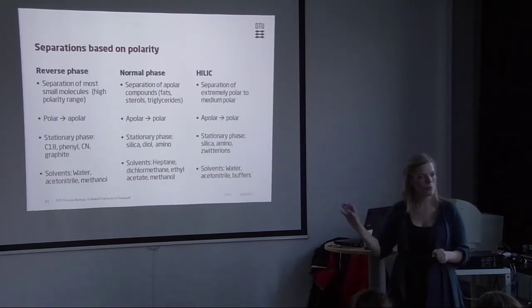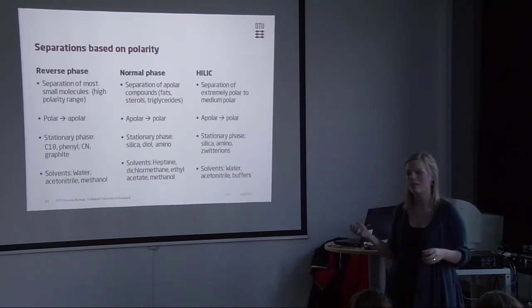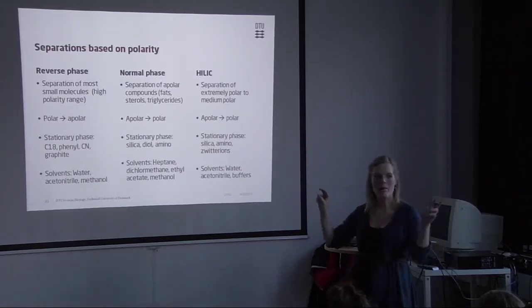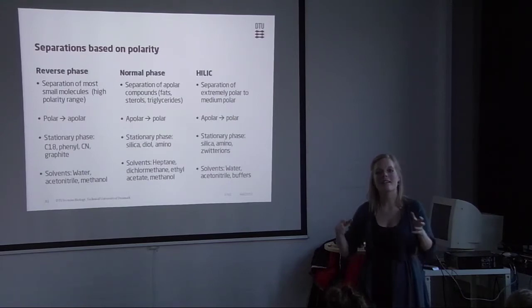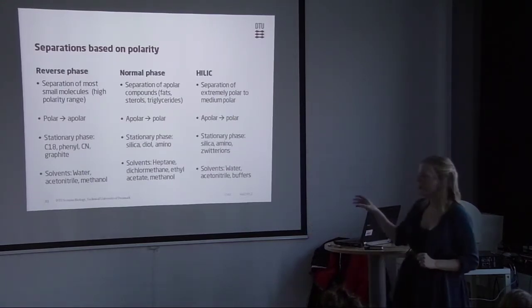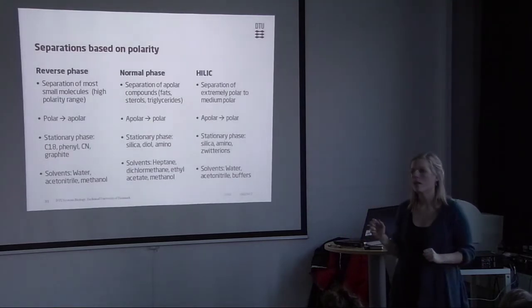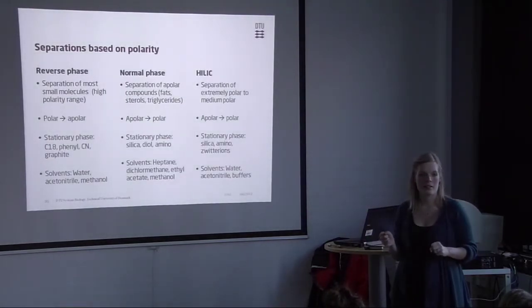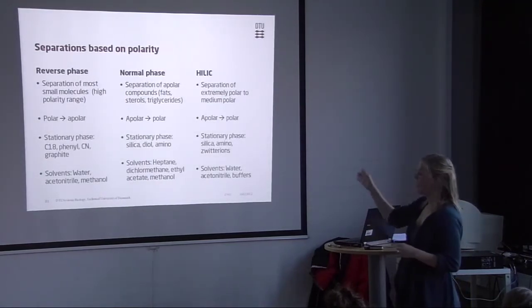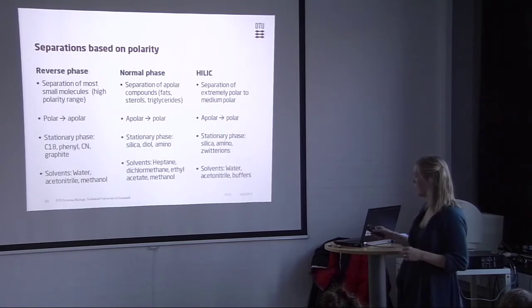While in HILIC, we can use water. Water is actually the basis of hydrophilic interaction chromatography, which means that this is a type of aqueous normal phase that we can use when we want to detect by MS. So we use water, we use acetonitrile, and we use different kinds of buffers, salt solutions, as a mobile phase for this one.